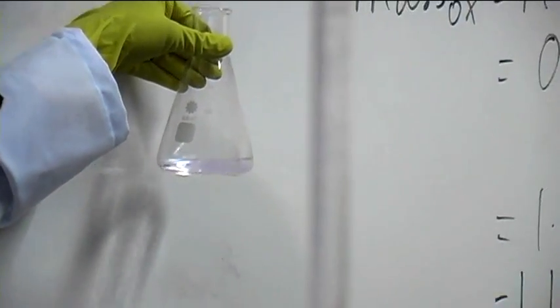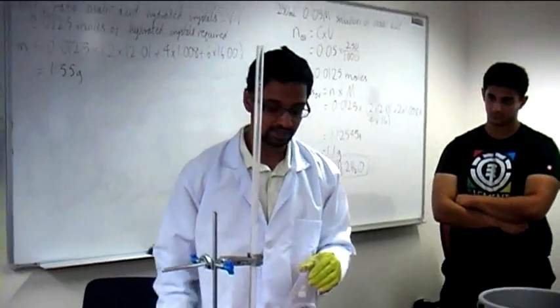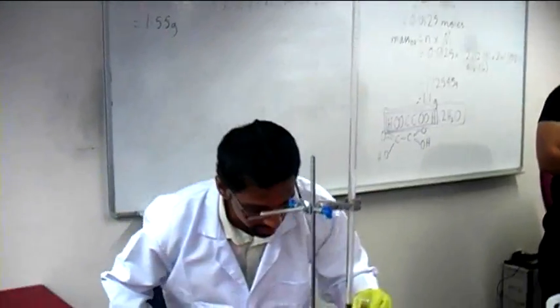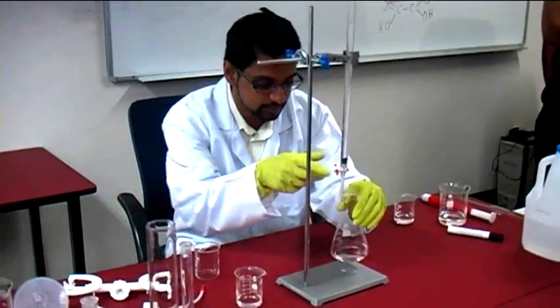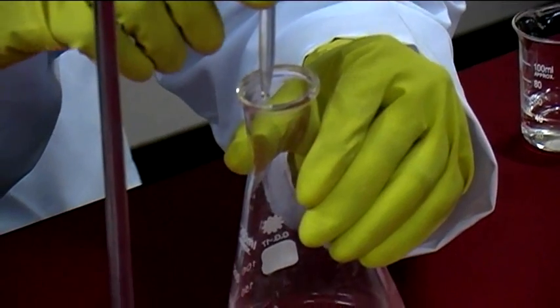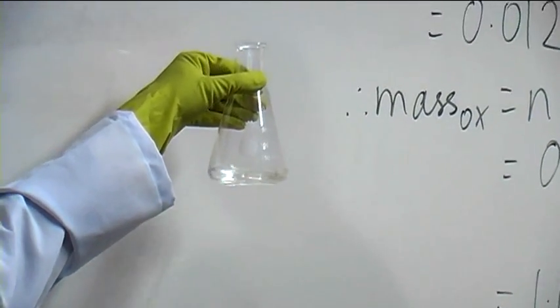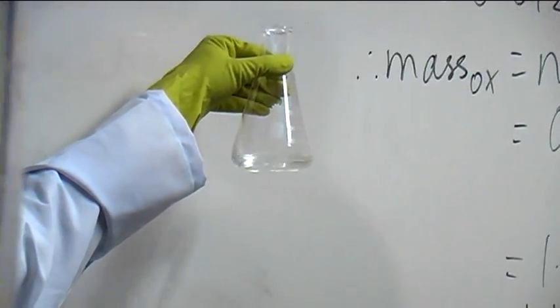Let's put this one blue. Everyone can see that. It's still slightly pink, but it has definitely changed color, right? It's become a lot less pink. I'm going to go one drop at a time from here on in. Let's, my God, yes, then drop it. Colors. There you go. You can see there's tiny two drops made such a big difference to the color.